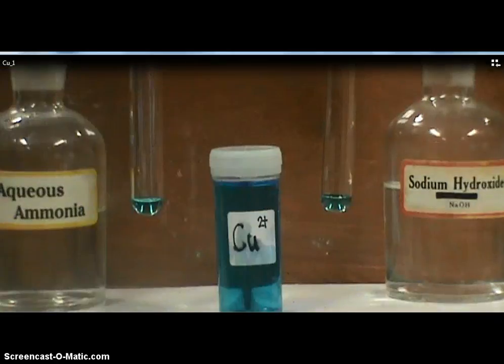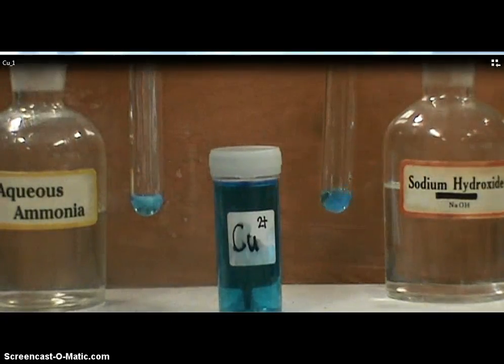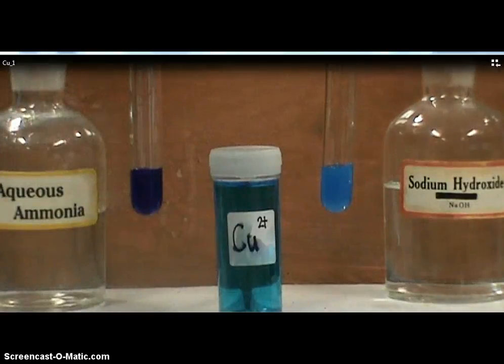Moving on, let's take a look at the copper 2 ions. When a few drops of alkalines are added to the solution containing copper 2 ions, a blue precipitate is formed. Upon addition of an excess of the alkaline, the blue precipitate remains insoluble in excess aqueous sodium hydroxide, but the precipitate dissolves in excess aqueous ammonia to give a deep blue solution.